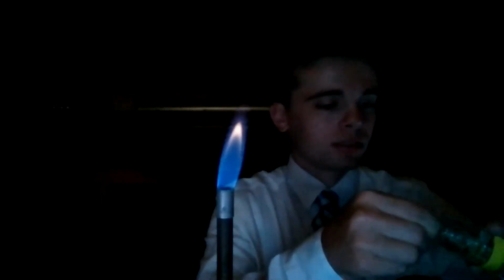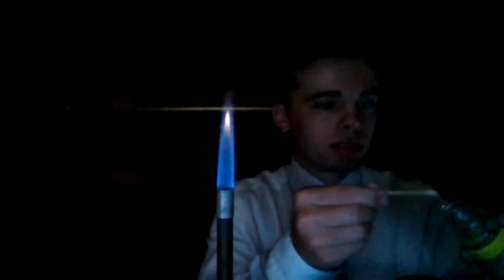Yeah, this is a nice red color. Which one do we want to do next? We do potassium. I think I heard calcium first, and then we'll do potassium. Okay, calcium. Last time calcium was not my friend, and it did not want to burn. So we'll see if I can do better this time.